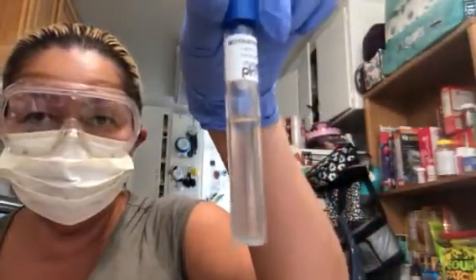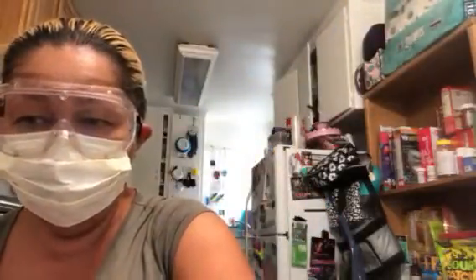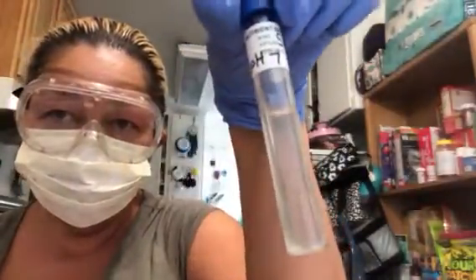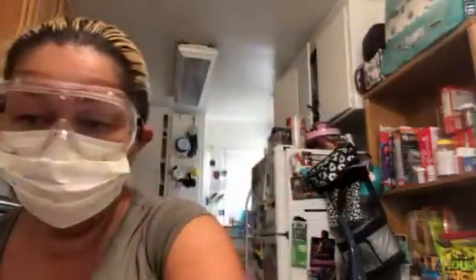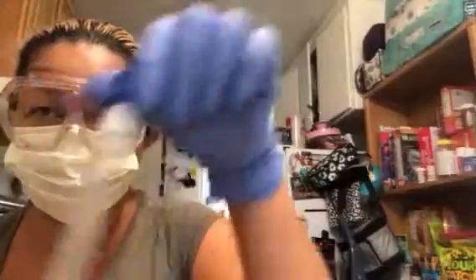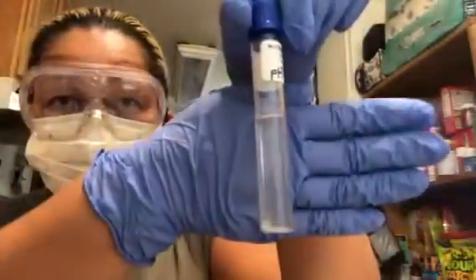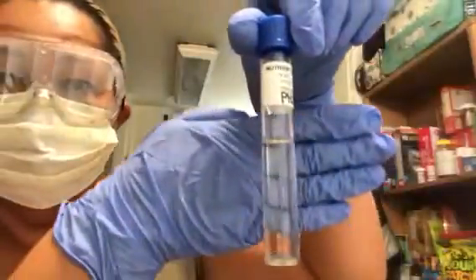You can see that. And this is the pH 5 for the S. cerevisiae. And this is pH 7, S. cerevisiae. There's some turbidity there too, for sure. And then S. cerevisiae, pH 9. Again, turbidity. You can see that. It doesn't look clear, that's for sure. Okay, now we're going to move on to S. epidermidis. So this is a pH 5. That's pretty clear.